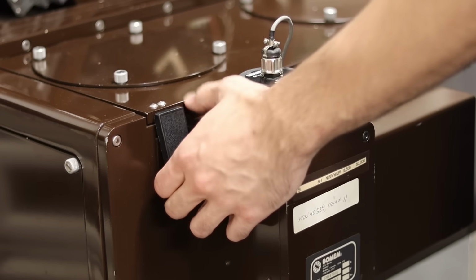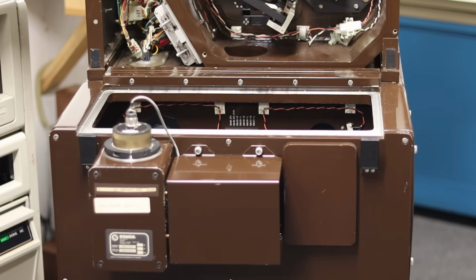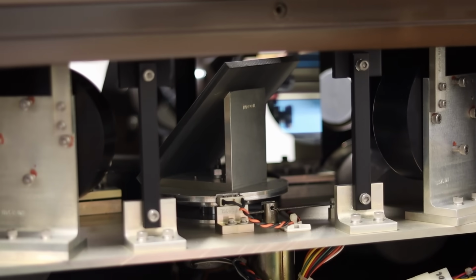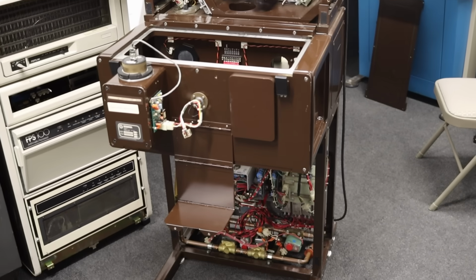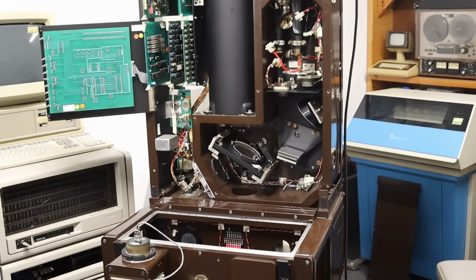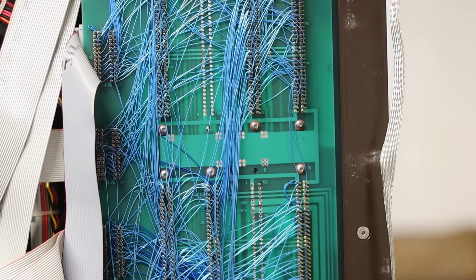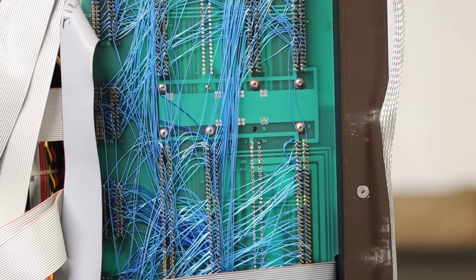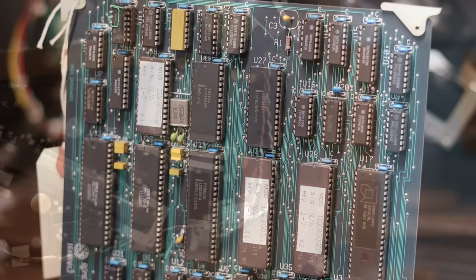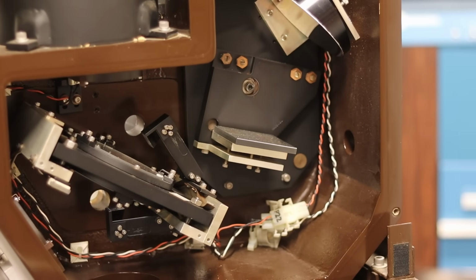Then there's this little plate on the top here. If we undo the 2 clasps that hold it on, it gives us access to where the object under test is going to go. And then if we walk around to the back and take off the plate back there, we can see there is another whole mess of mirrors down there. We're in the thick of it now. This thing is absolutely stunning to look at. It is also stunningly complex. There is so much going on. I mean, we have a full wire-wrapped backplane with 5 cards that are filled to the brim with ICs implementing some pretty complex logic, and this mess of mirrors here is wildly complex.